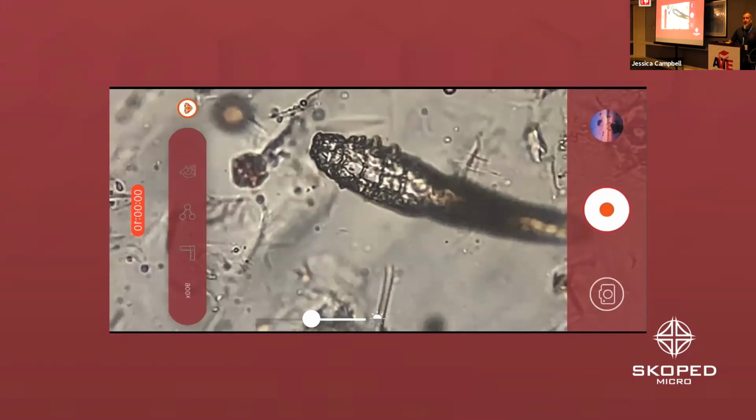That was the one concern when I first talked with Kate 3 or 4 months ago, maybe 5 months ago: people would send pictures and she'd say, oh, I wish I had this a little bit over there. When we first visited and talked about the broadcast ability, she said, so you're telling me that Dr. Jones could send me a picture and I could email and go, hey, put that back up there?